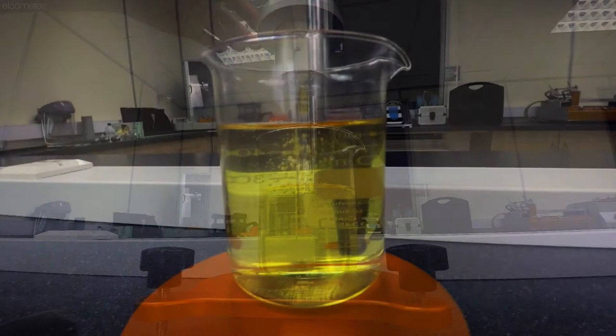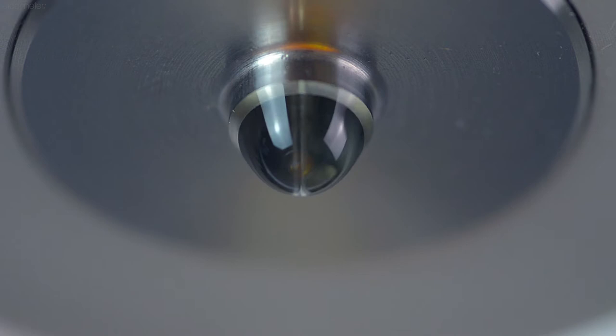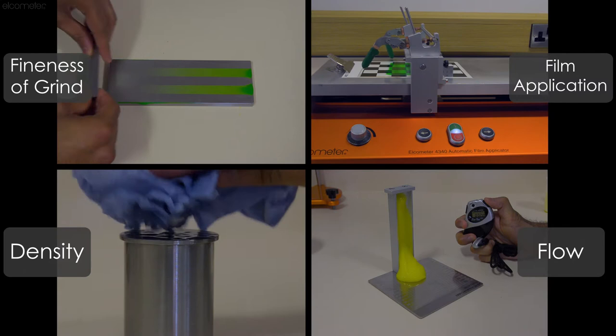It's a common misconception that the viscosity of a liquid is a measure of how thick or thin it is. When measuring viscosity, what you're actually measuring is the resistance a fluid has to flow. The viscosities of paints, varnishes and oils, for example, can be typically measured as part of a series of tests to ensure they're fit for purpose.